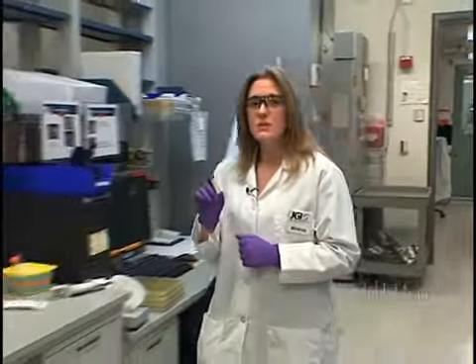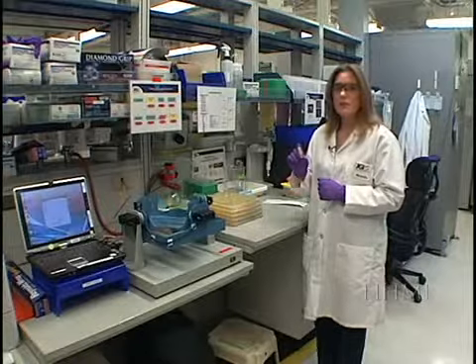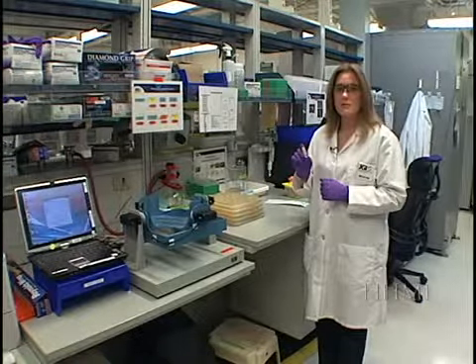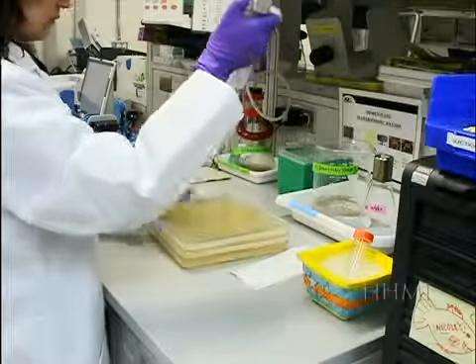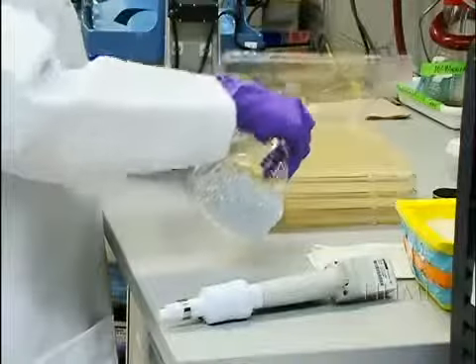Here's our sample of E. coli bacteria. We've allowed the bacteria time to recover from their shock treatment in the electroporator. Now we're going to take this sample to the plating process, where we will identify which bacteria incorporated the plasmid with our DNA insert. Remember, only 1 in 1,000 bacteria incorporate the plasmid with our DNA insert. The transformation stock of E. coli is diluted and spread evenly onto large 9x9 agar plates with the help of glass beads.